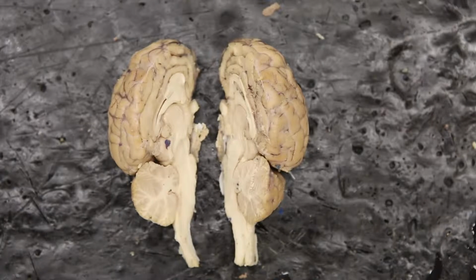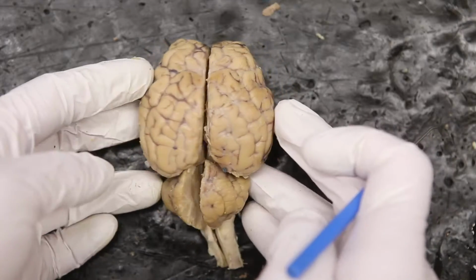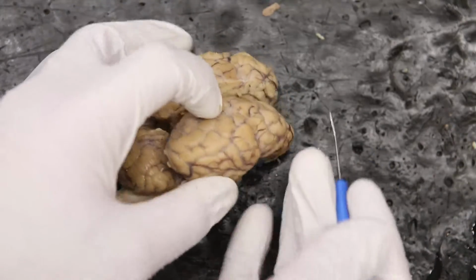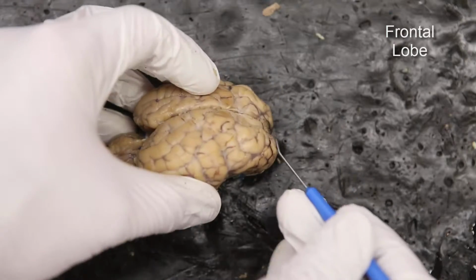Here we're looking at a dissection of the brain. In this view, we're seeing a mid-sagittal, or at least as close as possible to a mid-sagittal cut. If we put it back together momentarily, you're going to be able to see the individual lobes. Up front here would be the frontal lobe.